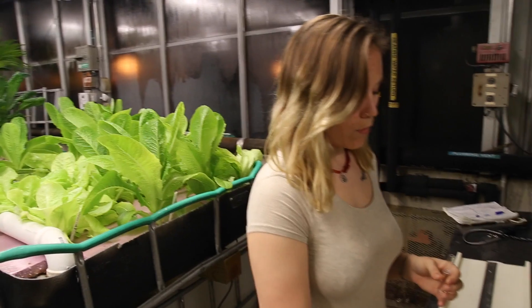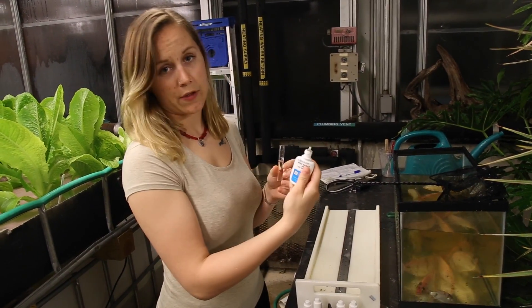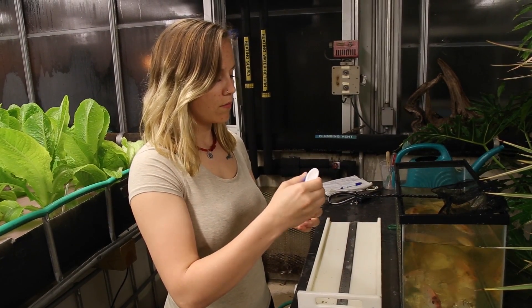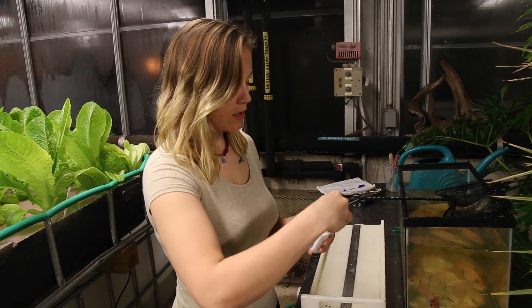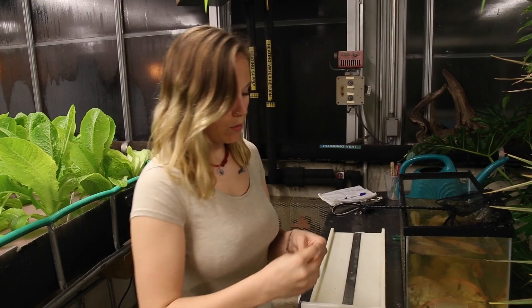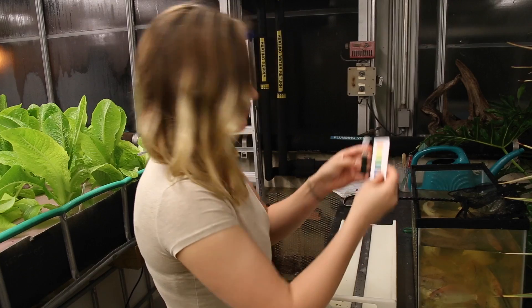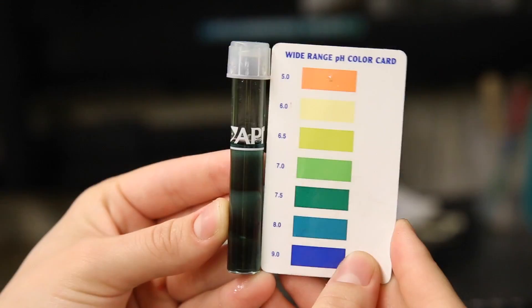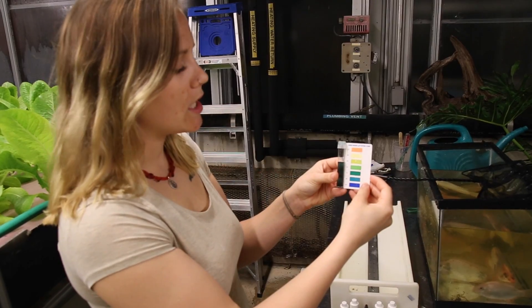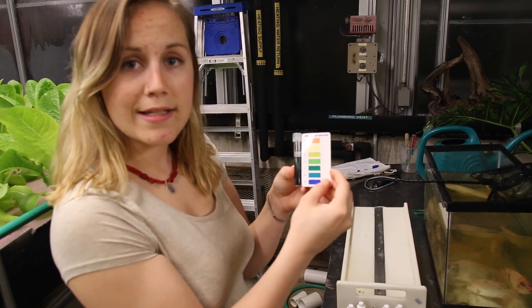First, what we're going to do is pH. With this chemical test, we are going to add five drops. This is going to show what the pH of the water level is. And you put it up to the color — you just match up the color of the water to the color on the test. As you can see here, it's 7.5, which is relatively neutral for our system.